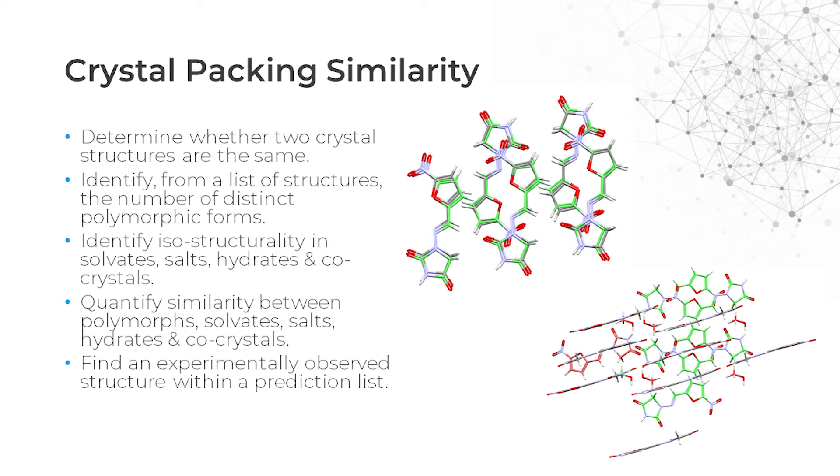The Crystal Packing Similarity Tool compares one or more reference structures to one or more comparison structures and quantifies the degree to which these are similar. It does this by identifying how many molecules within a reference cluster match the associated cluster of the comparison structure by overlaying them.